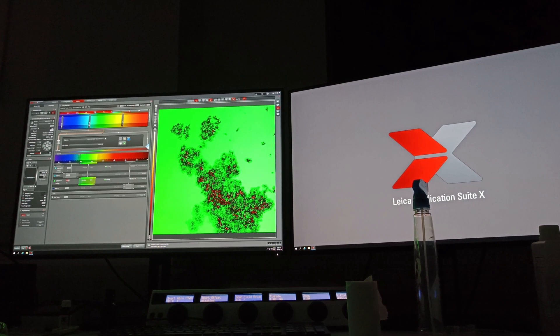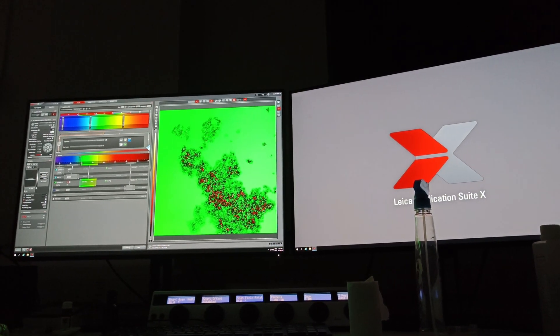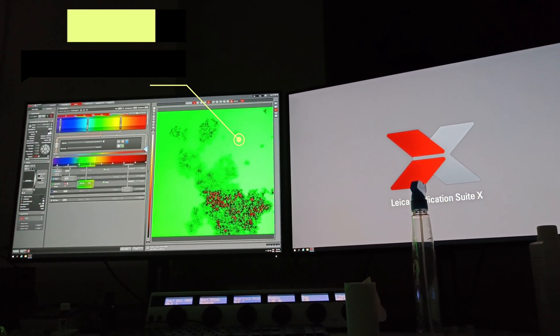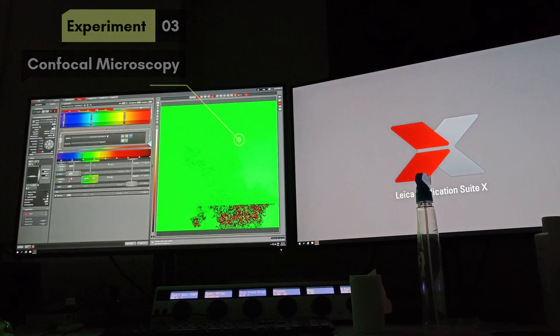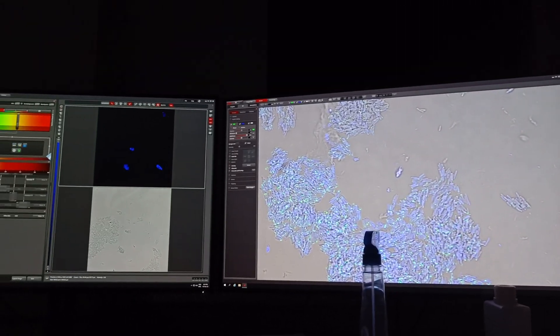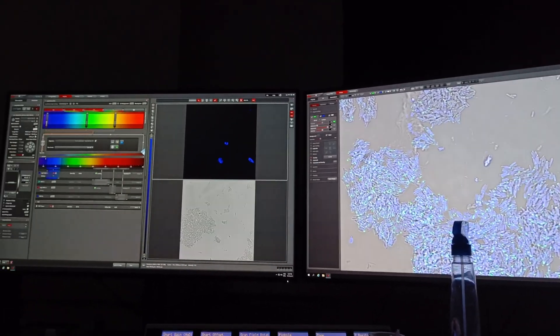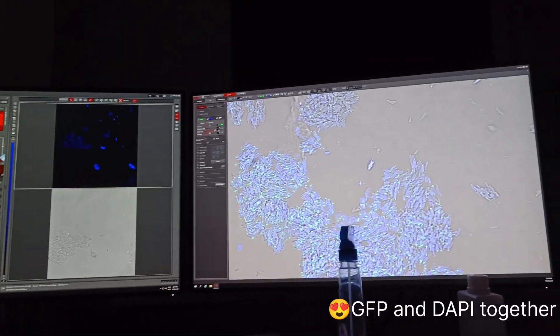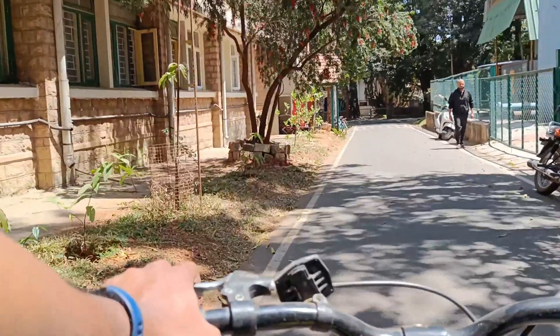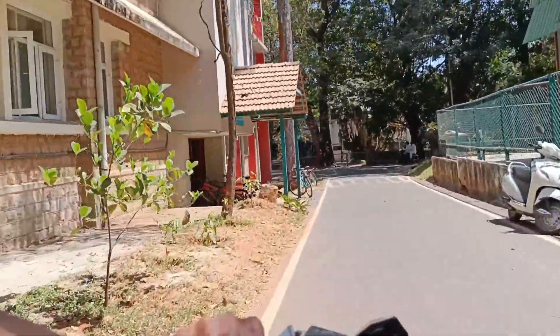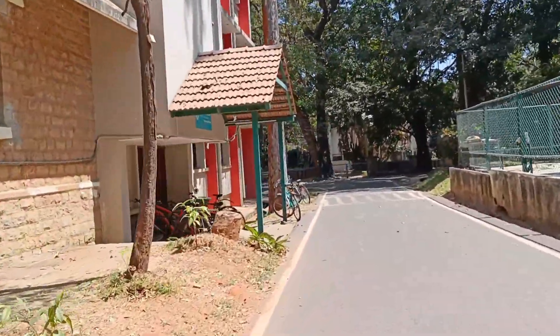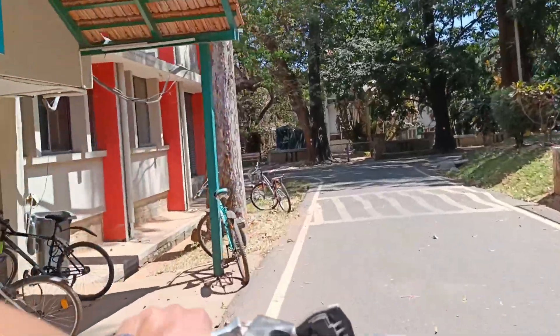In our samples, some genes are tagged with GFP — green fluorescence protein — and we have also stained our samples with DAPI, so we can see green and blue light emissions. Our confocal microscopy went well and now we are heading back to our department.